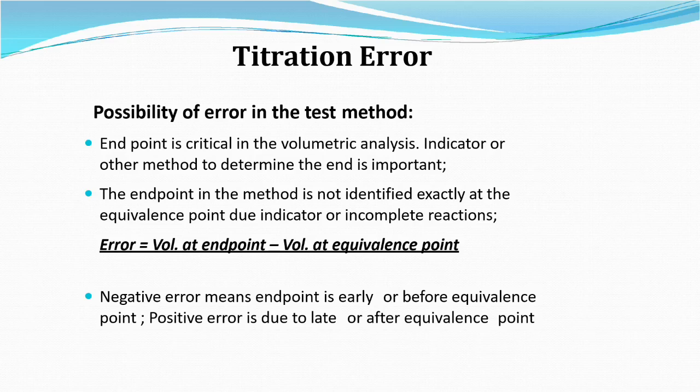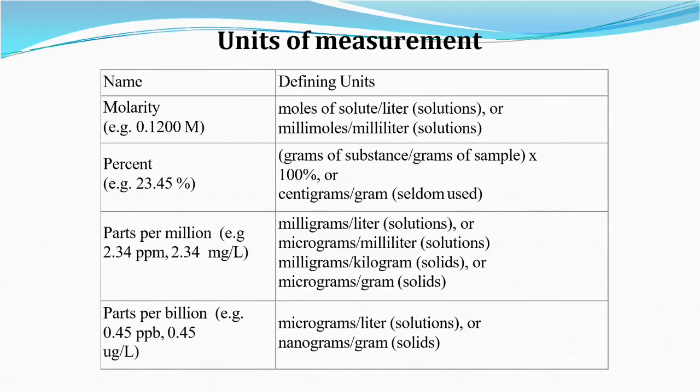Here are some of the common errors which take place during the titration.